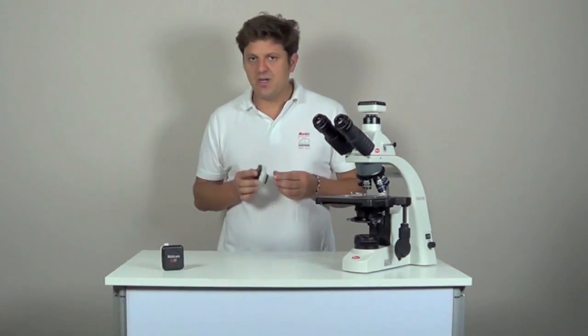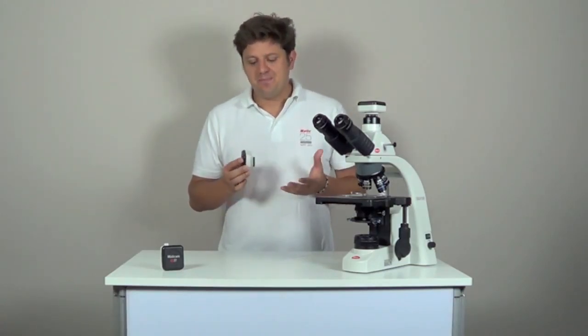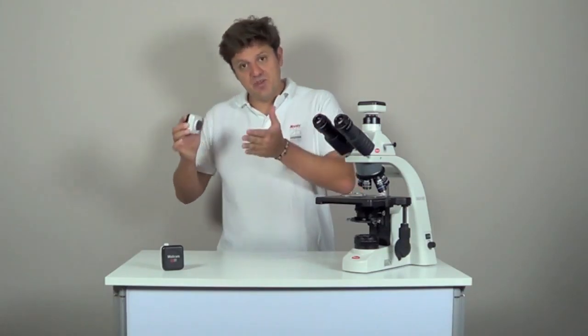Moticam 5 and Moticam 10 are high resolution cameras with a resolution of 5 and 10 megapixels respectively. They are meant for documentation, so printing and publishing. They have a higher pixel density, and this makes them a bit slower than Moticam 3. They have a specific use, which is taking images for printing afterwards.